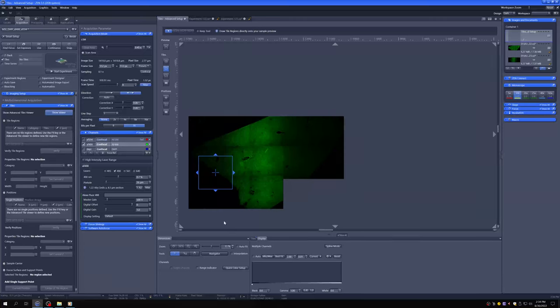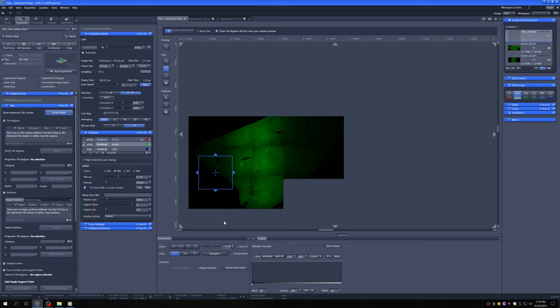I'd like to discuss now how to deal with a frequent thing that occurs, which is that your slides are tilted. The most common reason this occurs is because you use a coverslip that extends all the way to the edge of the slide. That props up one end on the inverted microscope configuration, and as you move from left to right and sometimes from top to bottom, you see that the focus drifts out of position.